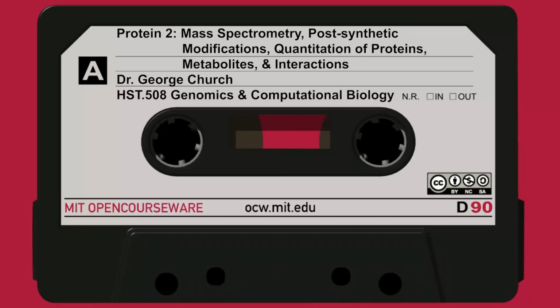Another big consideration here is that not only are these things not exactly integers, but in natural abundance they're a mixture of the major isotope on the far left and the second and sometimes third and fourth stable isotopes, usually non-radioactive isotopes, which are present in nature. And the most abundant in this particular list is C13, and it's most abundant in 2 senses. One is it's the highest fractional abundance of any of these elements, and secondly, carbon itself is very common in peptides.